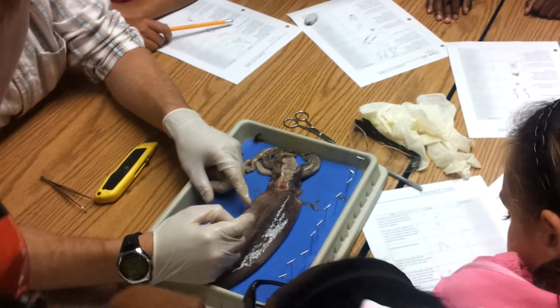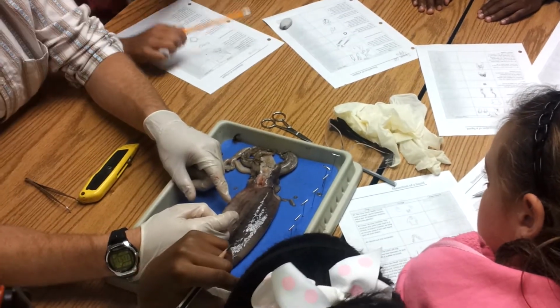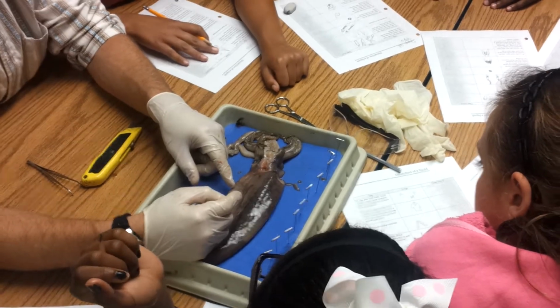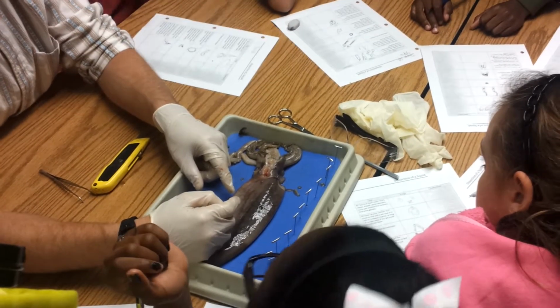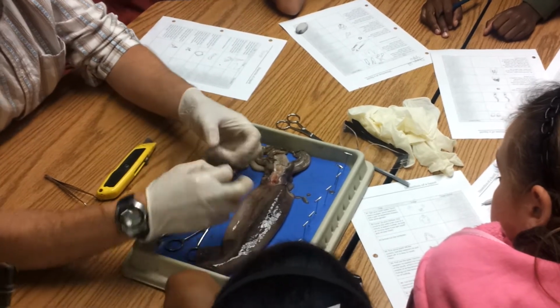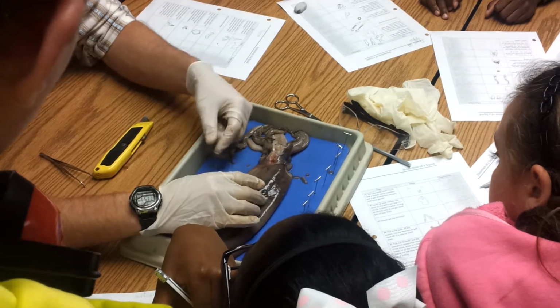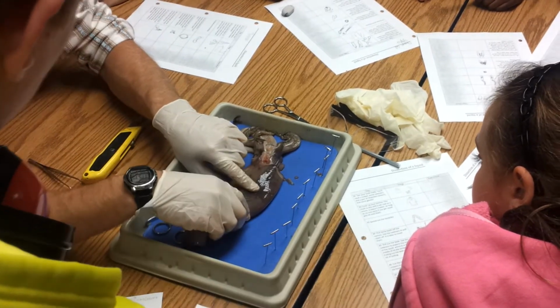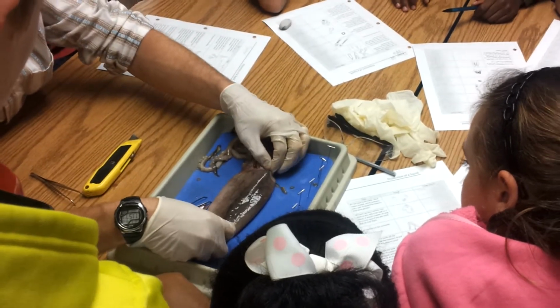Remember, a squid is a mollusk. It's a relative of the snail, and snails have shells. Well, over probably millions and millions of years, the squid lost its shell and became a soft-bodied animal that could move around in the water much more easily. But what's left is back here, there's a little flexible thing. I'm going to pull that out. It's called the pen because it looks like a pen.